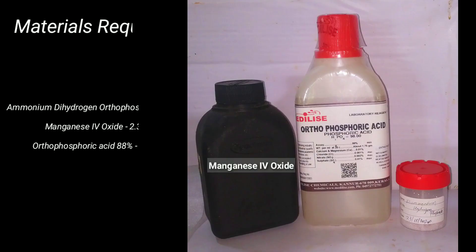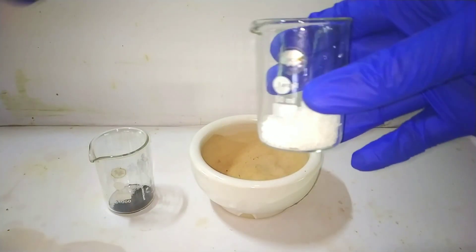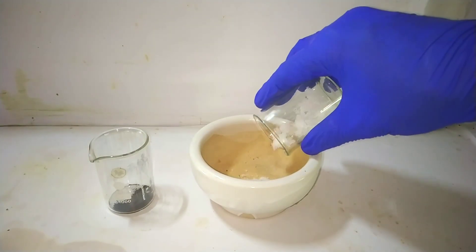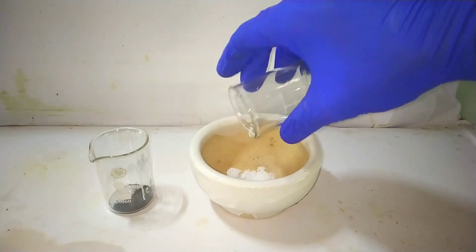Materials required for this preparation include 9.3 grams of ammonium dihydrogen orthophosphate, 2.3 grams of manganese dioxide, and 10 milliliters of 88% orthophosphoric acid.